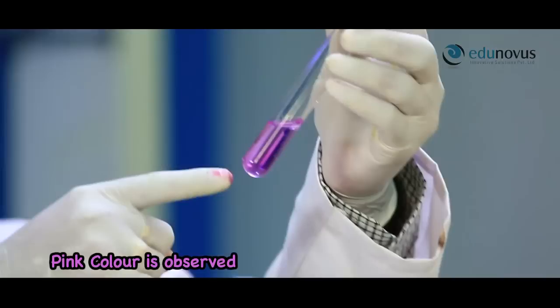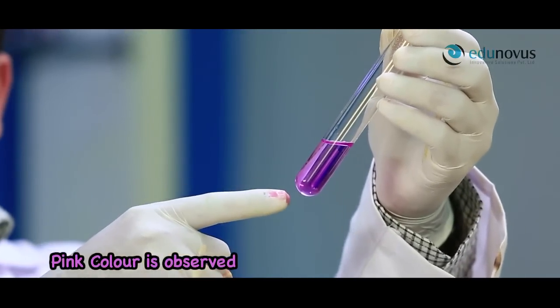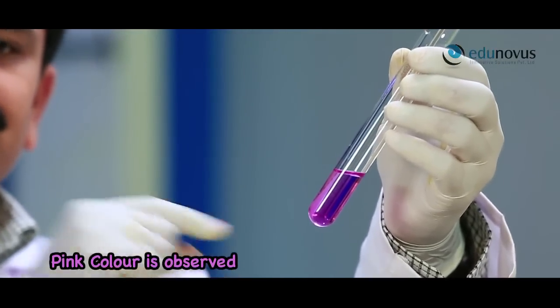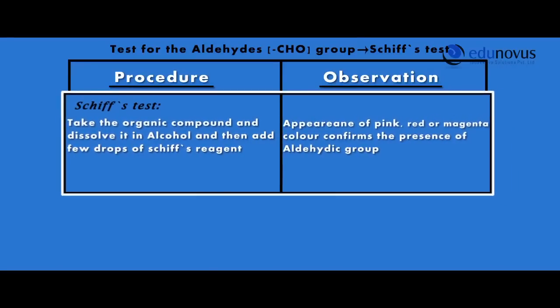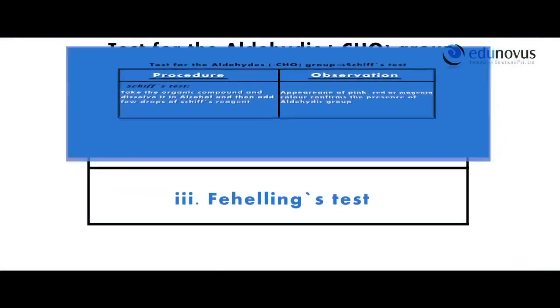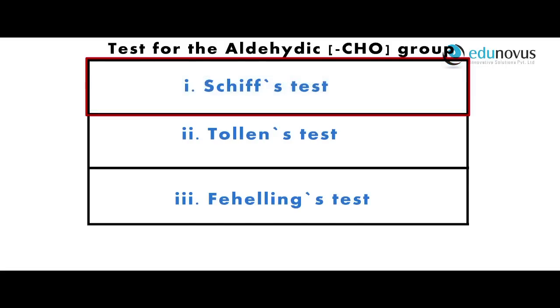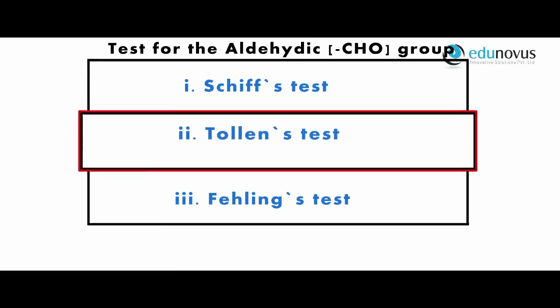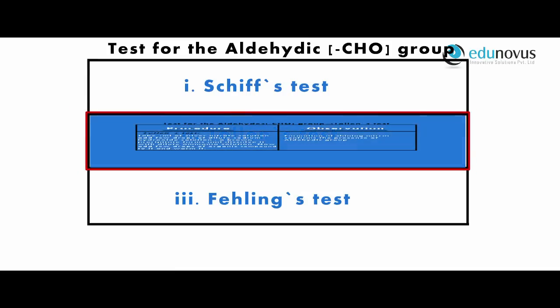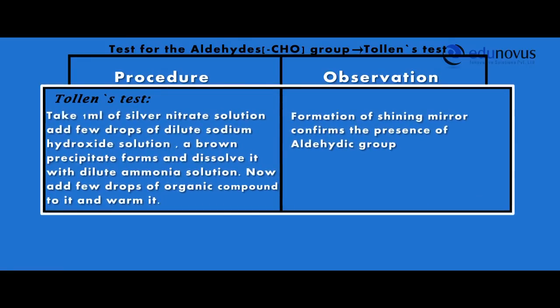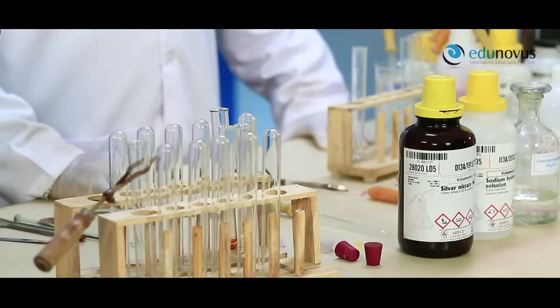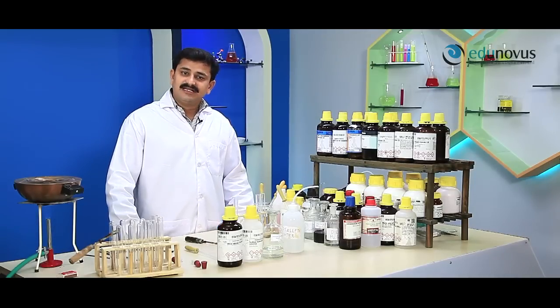Here you can clearly see the appearance of pink color, which confirms the presence of the aldehyde group. It can also be confirmed by using Tollens' test, or the silver mirror test.